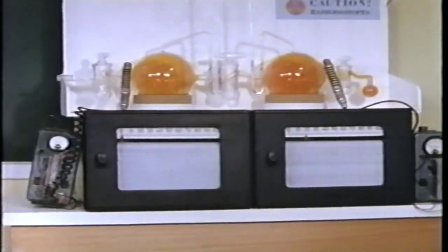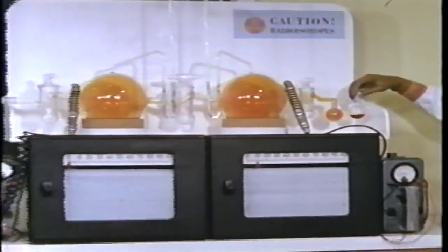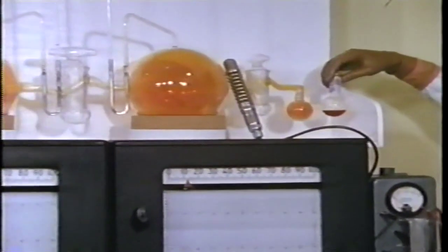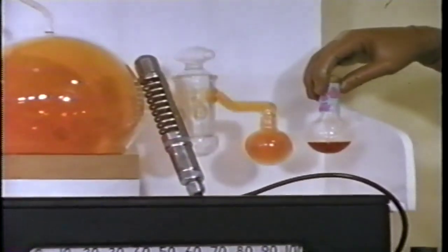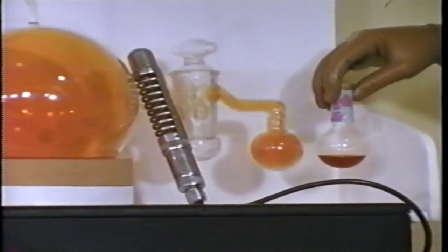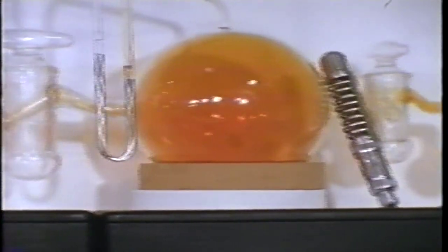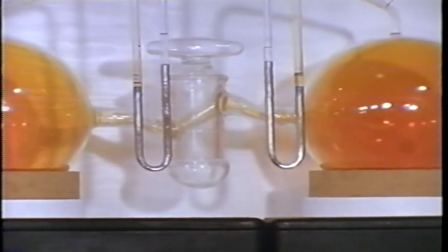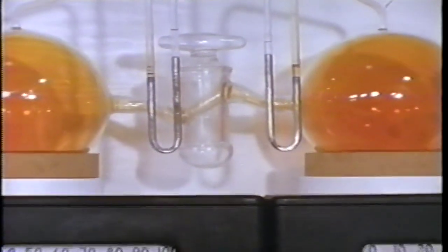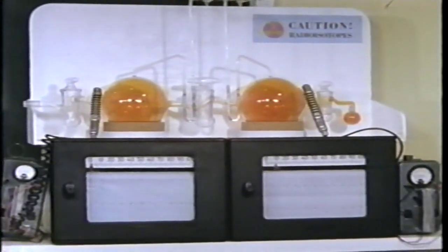On top of these recorders, we have a gas setup like the first one, except with this small bulb containing some radioactive bromine gas attached here at the side. The amount of radioactivity in this sample is so low that we don't need any protective shielding. Let's look over the experimental setup. The manometers show that the pressures in the two bulbs are equal. Pressure equilibrium exists.